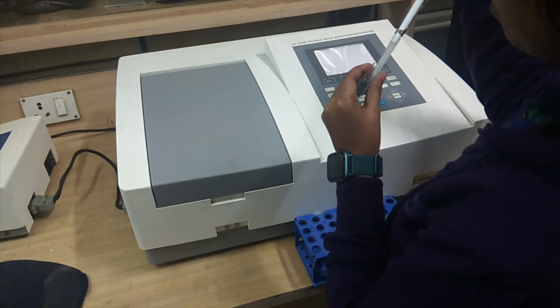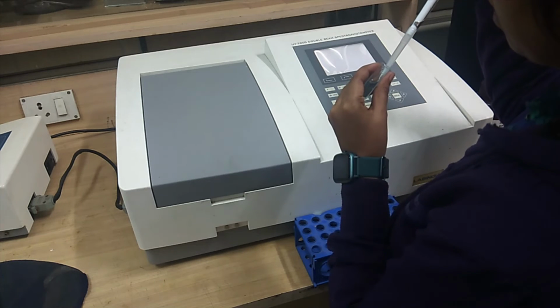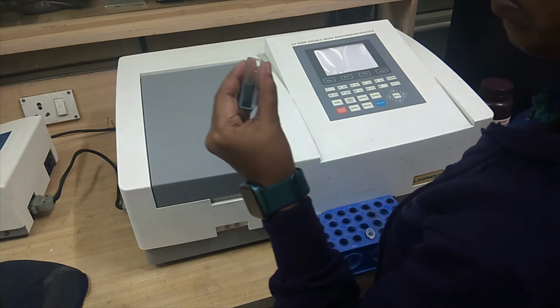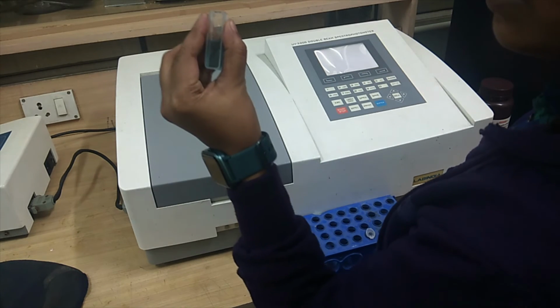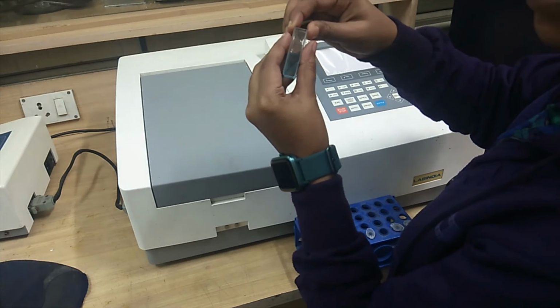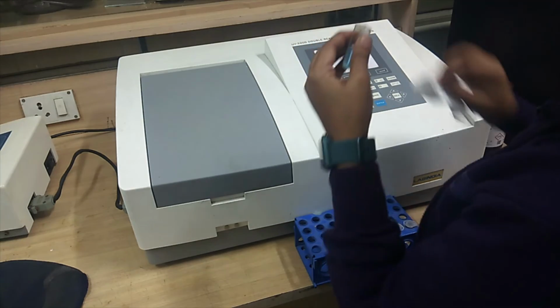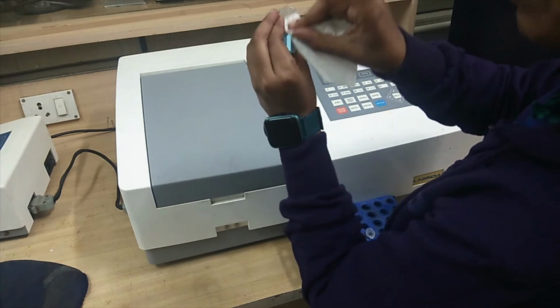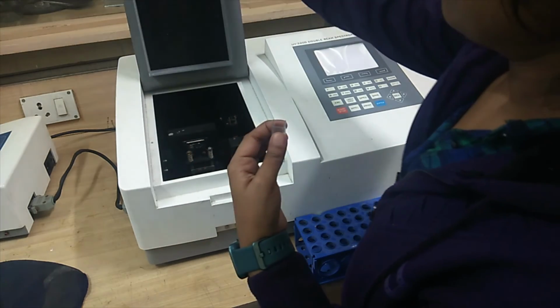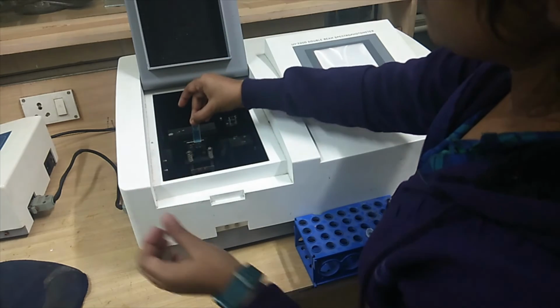This is our first dilution, and I have added Bradford solution inside it. As I said in the previous part, there occurs a development of blue color. Always try to protect the colored solution from light. Now we will take the initial reading of it, as we have already calibrated our system. This one is our sample slot now, and we'll put the sample over here.